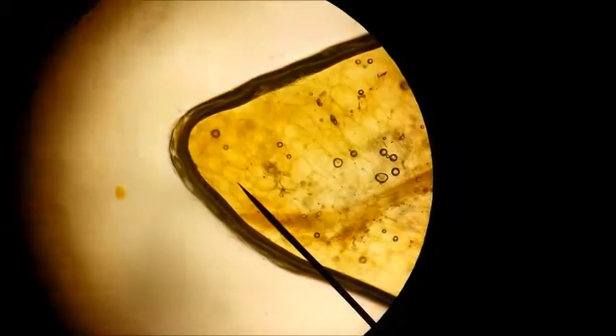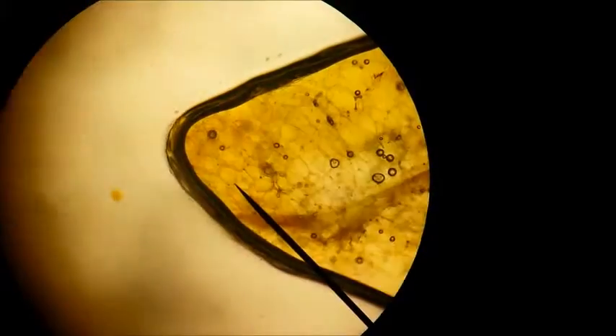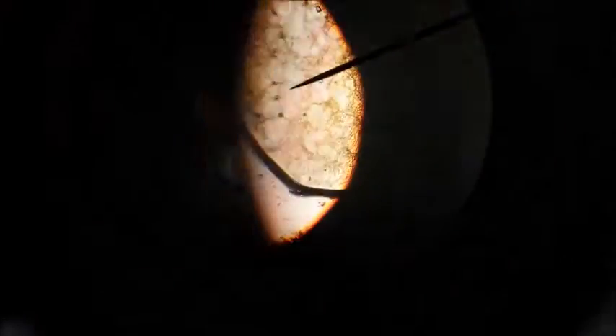We've done both the outer cuticle and the inner cuticle of each layer, and now we actually did the layer itself. Beautiful. It has a real parchment look to it.